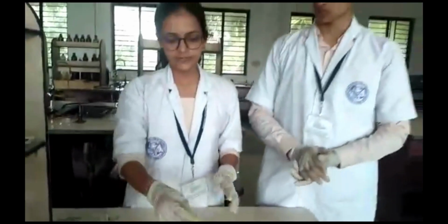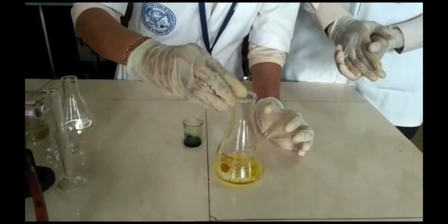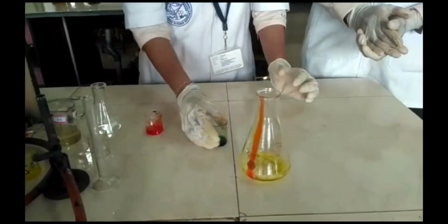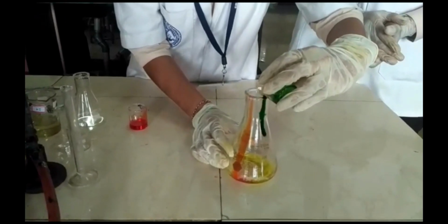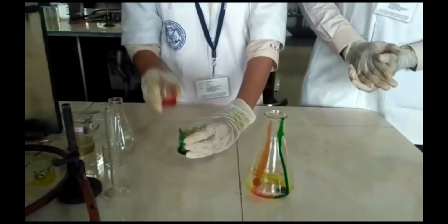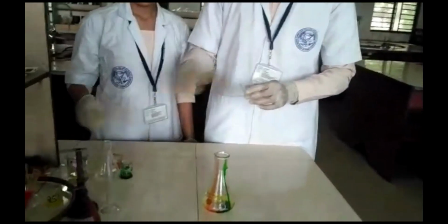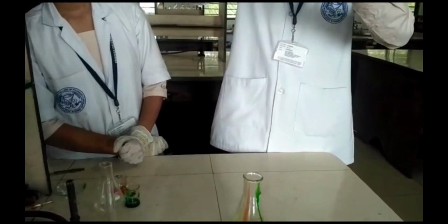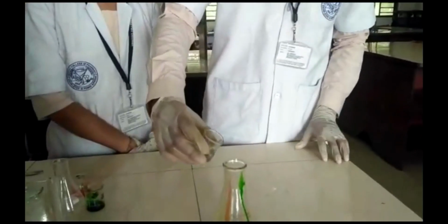And now I will add food coloring to the inner bar. Here I will add orange color. And here I will add green color. And now I'm going to add 5 ml of saturated potassium iodide. And now I'm going to place it inside the conical flask.